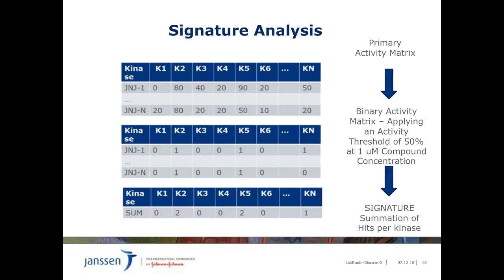The objective of the kinase inhibitor screening is to identify new kinases which potentially direct the equilibrium to the one or other side. To analyze the results, we wanted to emphasize the usage of the primary profiling data we have generated with the broad profiling experiment.